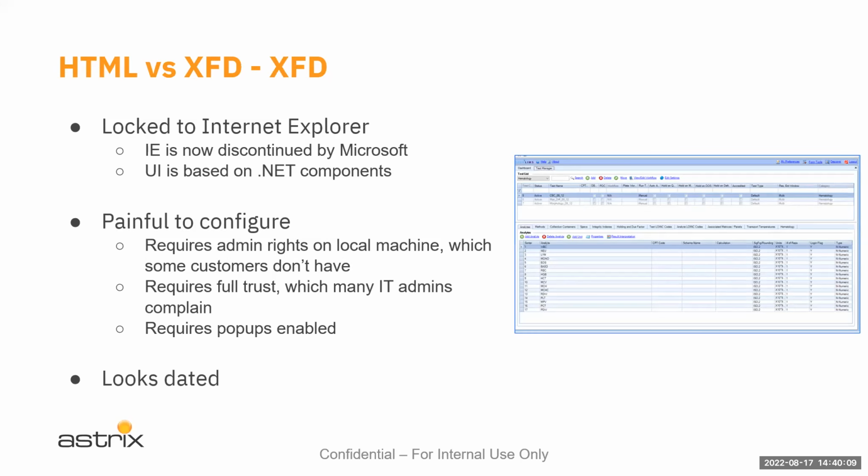So they're kind of discontinuing it, and they're making it so that you can still run apps, but IE is going away. Microsoft replaced IE with Edge. Okay, so that's the new browser from Microsoft, and then of course we have Chrome, which has been around for a while.